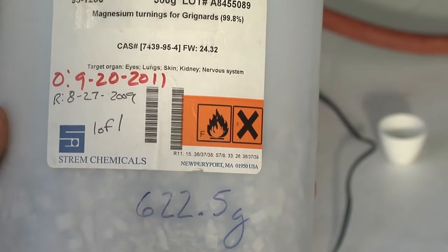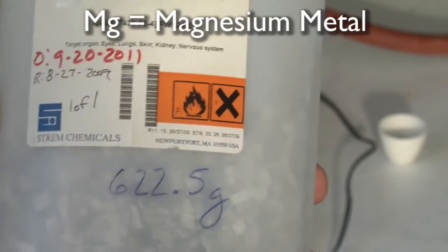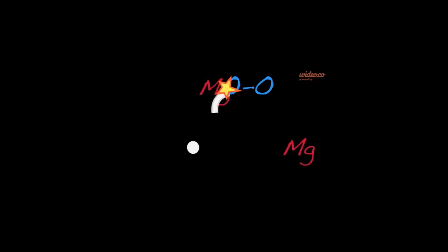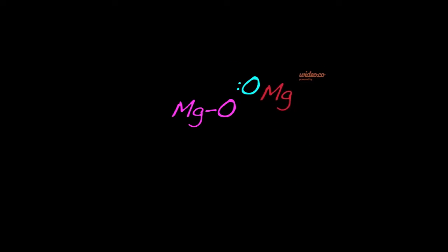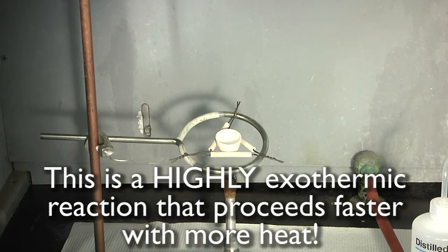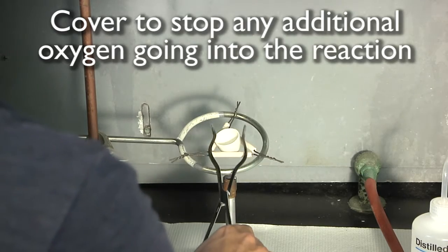Now let the chemistry begin! Add a half gram of magnesium and turn the heat back on. If you heat it gently, you should get a nice reaction with oxygen to produce magnesium oxide. Heat it slowly, and if it begins to smoke, immediately remove it from the heat source and cover it.